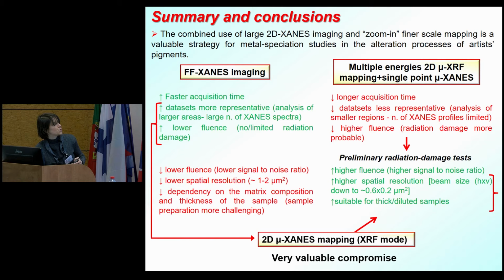to reduce the probability of damage, it also allows us to study any kind of sample regardless of the sample preparation in terms of thickness. So this can be a very valuable compromise, because full field XANES imaging sometimes works very well, but sometimes it's very challenging, depending on the type of sample that you are analyzing.